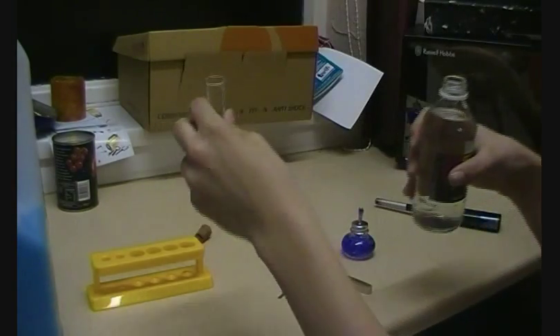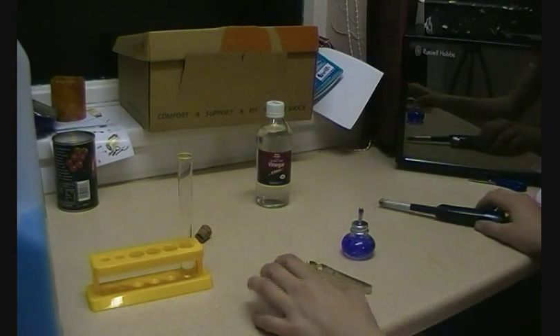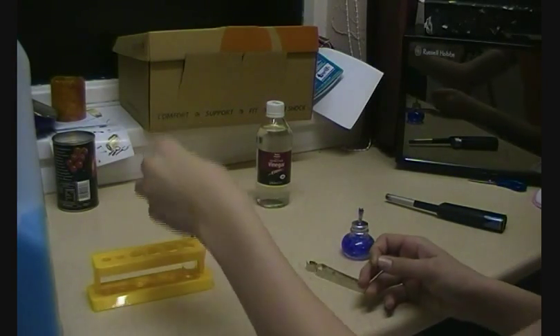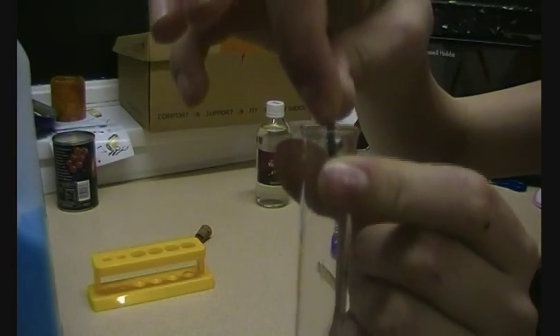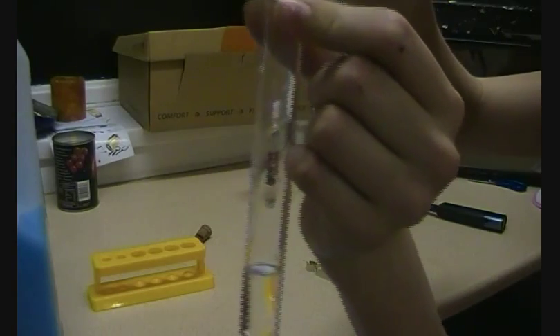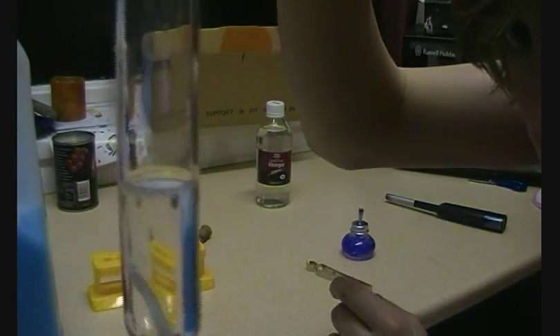About that much. Now we're going to drop the magnesium in the tube like this and watch what happens. We see bubbles, and those are bubbles of hydrogen.